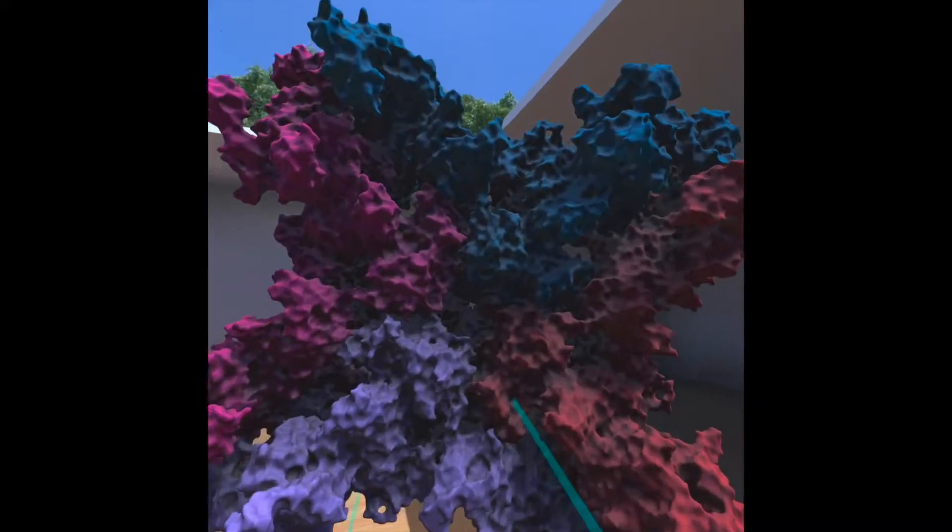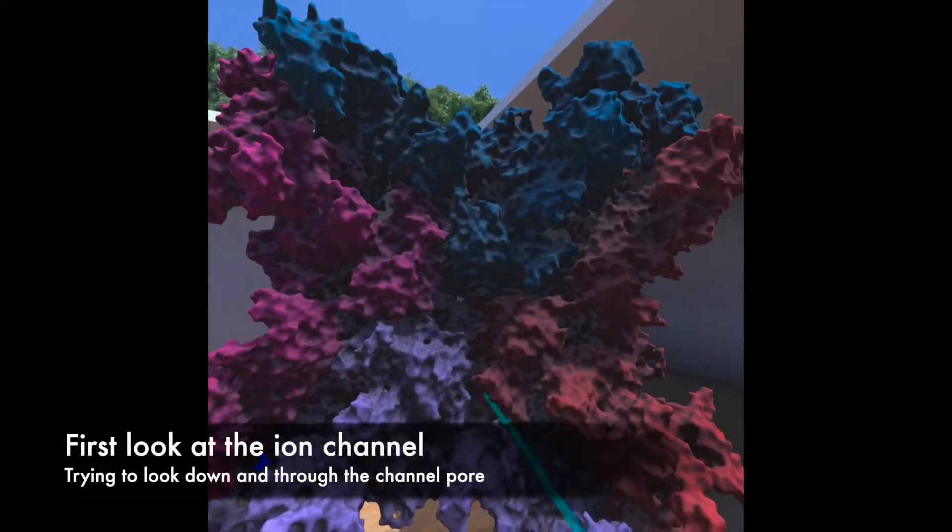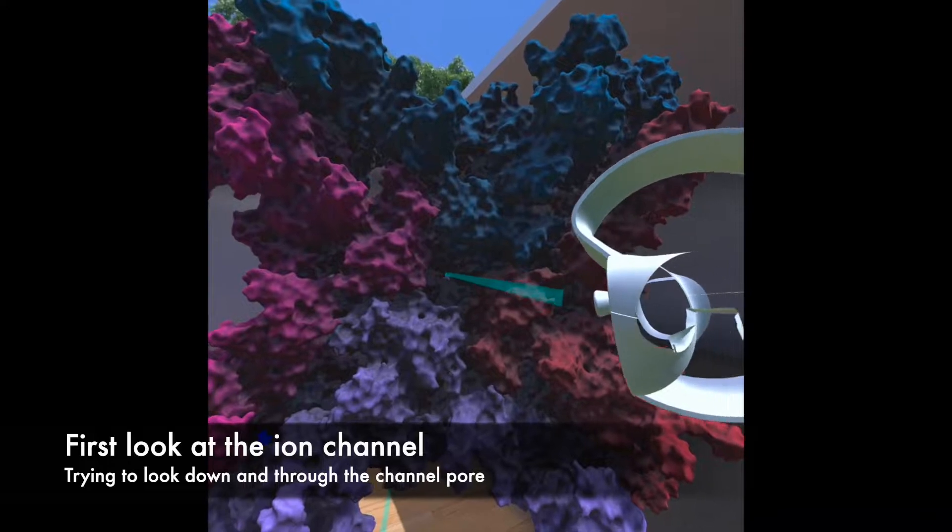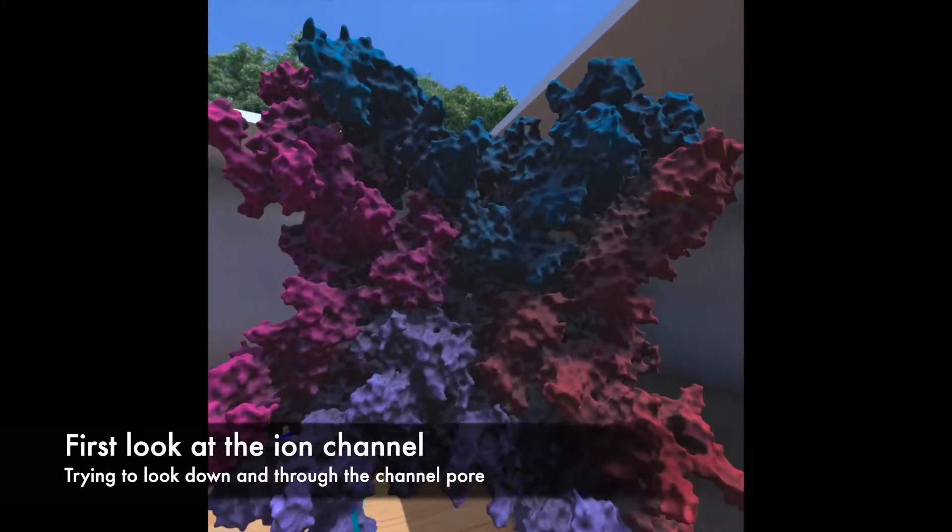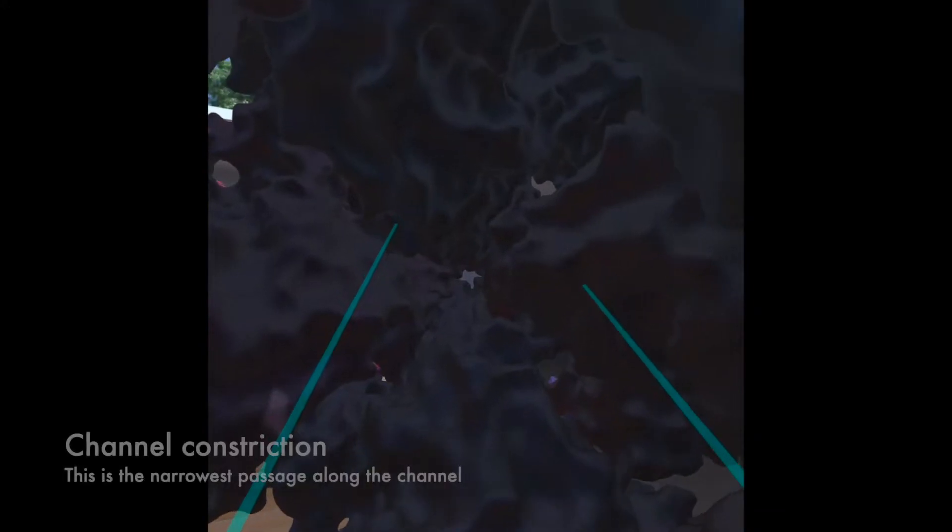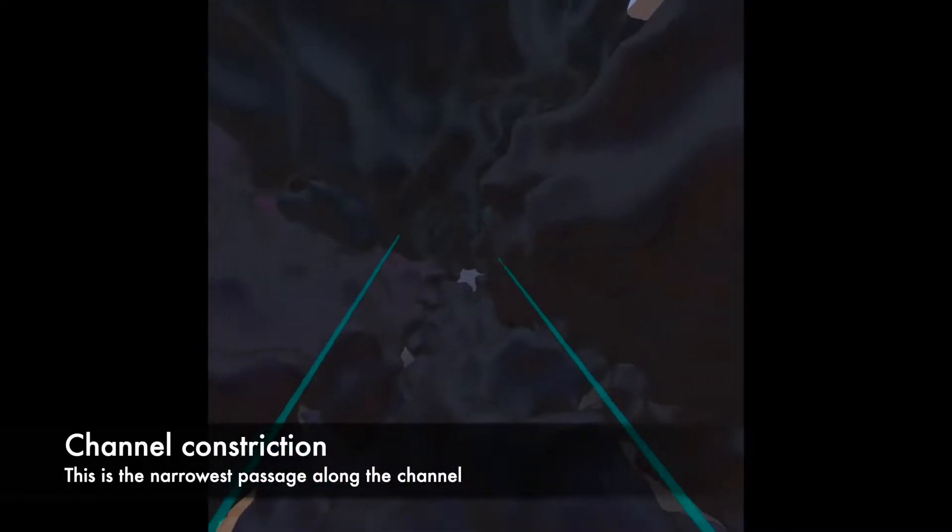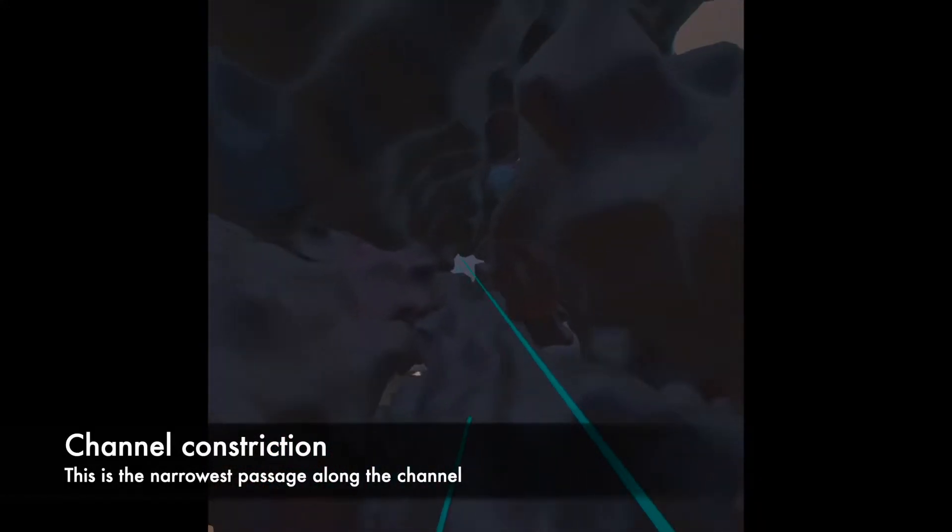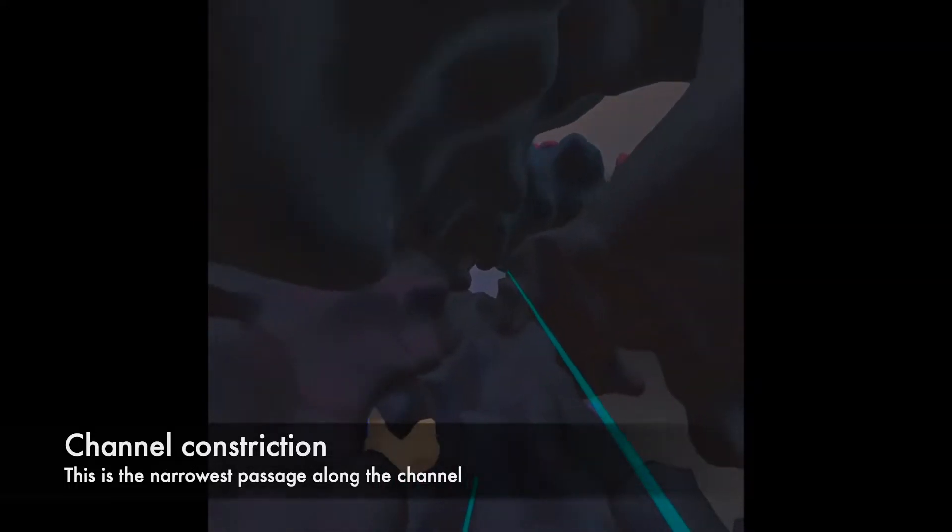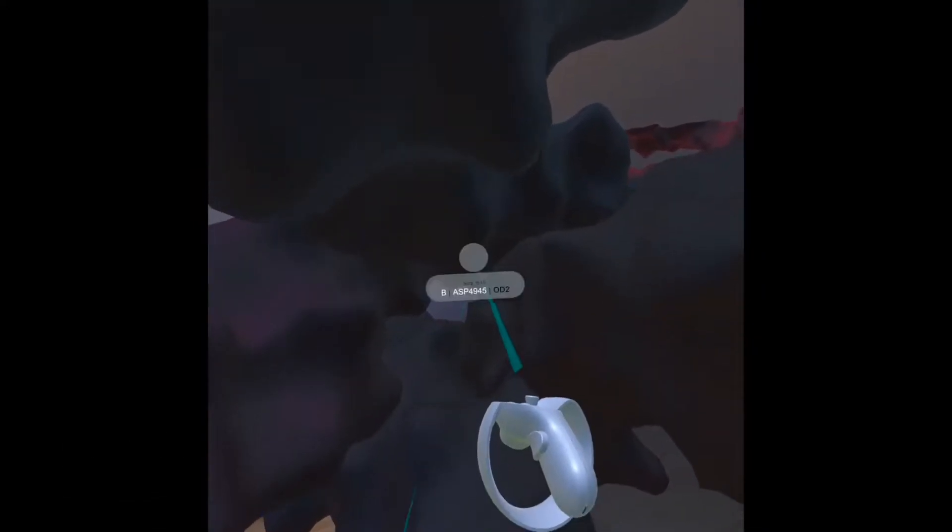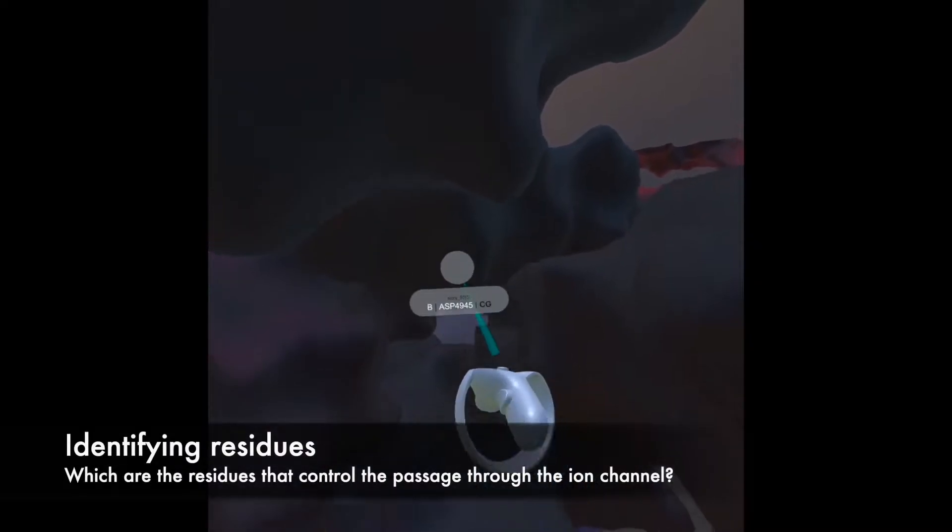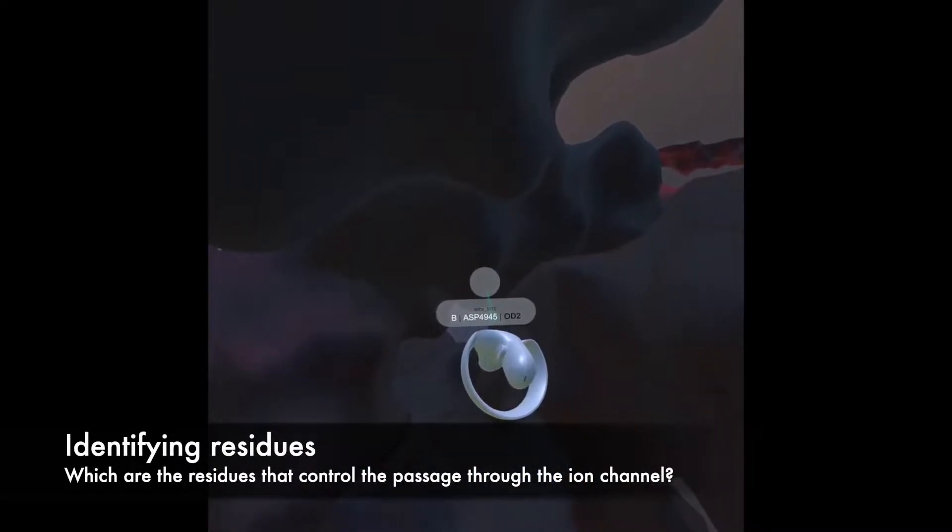We're looking down the channel of this molecule right here where the ions would go through. And in particular one can nicely see the constriction that happens at this level. So I can zoom right in and go here and look what are the residues that make up this constriction.